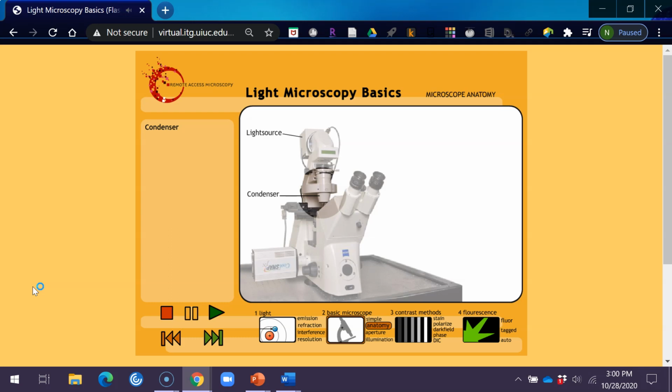A research-grade microscope may have a special turret for holding multiple condensers which can rapidly be exchanged depending on the imaging technique being used. Techniques such as Nomarski DIC, phase contrast, and dark field illumination all require special condensers. A computer-controlled motorized stage allows the user to move the specimen with fine adjustment as well as collect multiple tiled images over time. Probably the most critical component of the optical microscope is the objective lens.